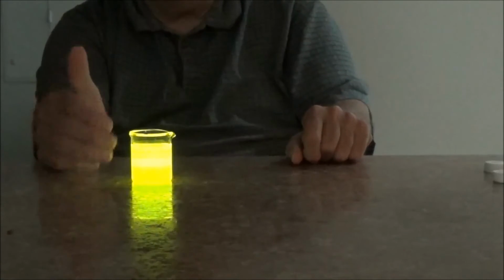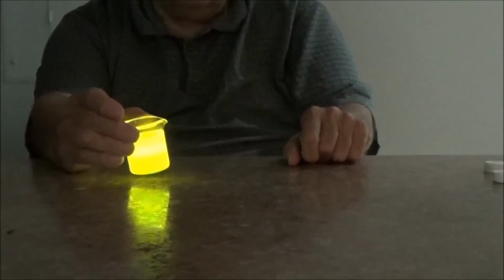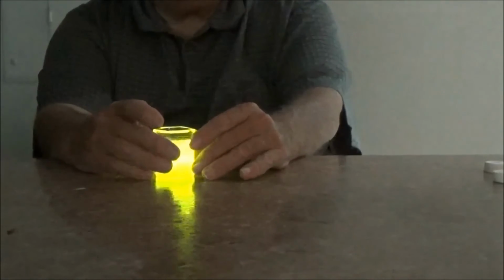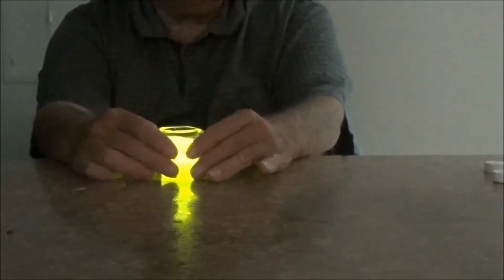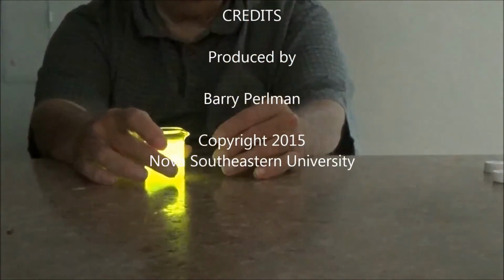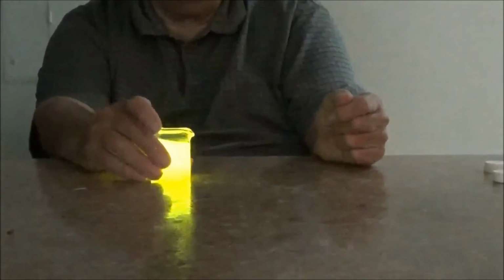The electrons are falling back down to ground state, and as they do so, they're emitting visible light, and it's cool. There's no temperature. It's neither exothermic or endothermic. It's probably a little exothermic, but you can't feel it. You just can't feel it. And that's our chemoluminescent demonstration for the day.